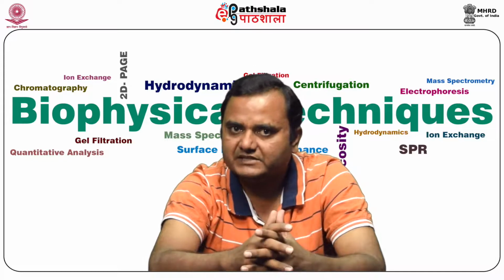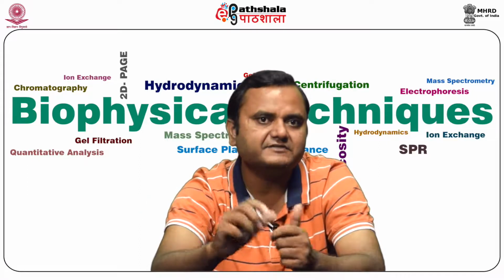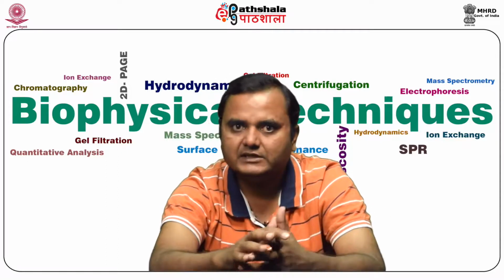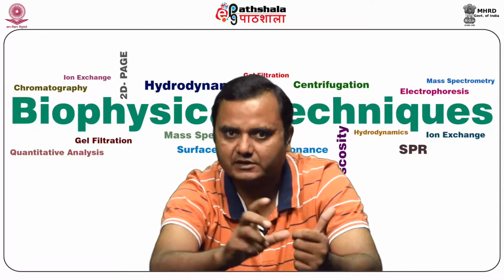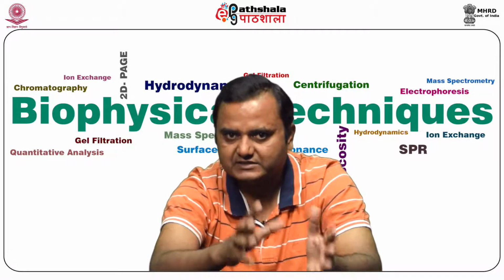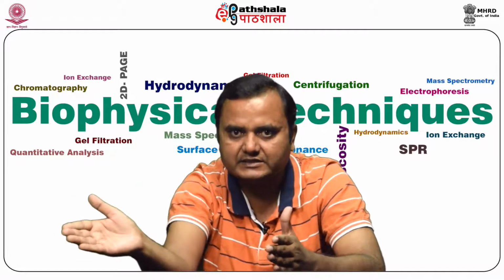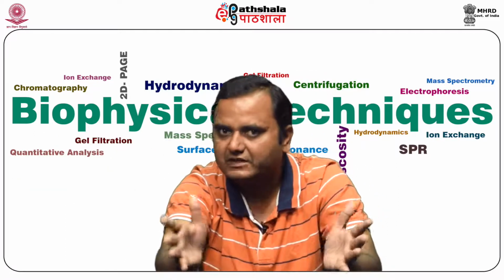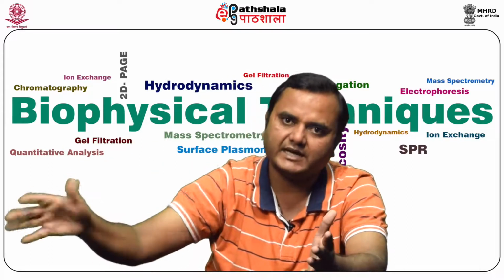So that is the widely used technique for the fractionation of the cell organelles. I'll give you a brief description of differential centrifugation. This technique is sometimes also referred to as differential sedimentation. As the name indicates, differential means that it differs in mass and size, and it is essentially a process of successive centrifugation, single or repeated steps, with increasing centrifugal forces. So first you centrifuge at a certain speed, then increase, and the increase in centrifugal forces causes settling of particles of different size at different speeds or different times in the tube.